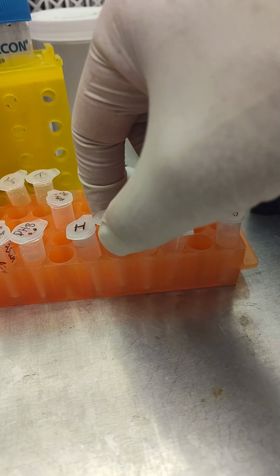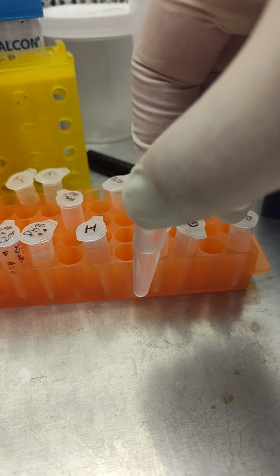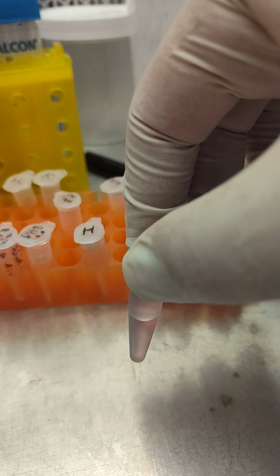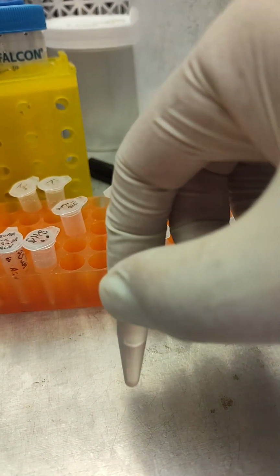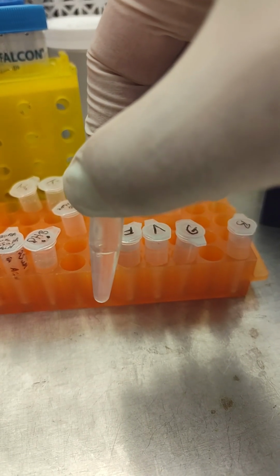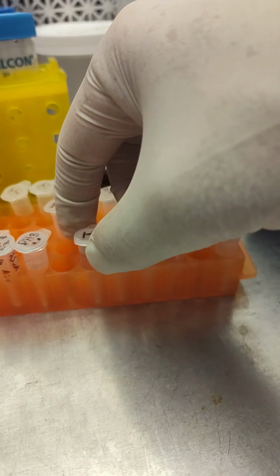And then if we go to the Fruit of the Loom, you can see we have an interface and it's almost cloudy. There's a cloudiness in the interface layer. So it's just evaluating the interface. And then the Hanes, you can see that one's just as clean as the Gildan, no interface, perfectly clean split. So that was just an interesting observation.